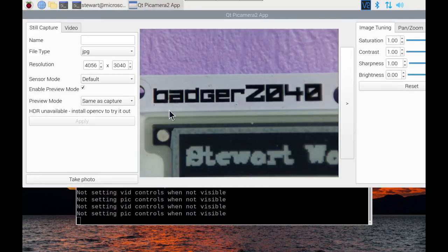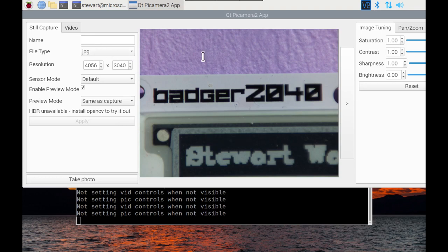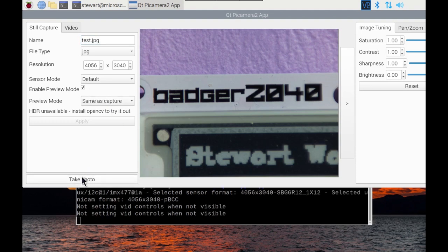And as you can see that's working now. So this gives you access to various different options and allows you to capture this in an interactive way. So we could just call this test.jpeg and we'll just take a photo.